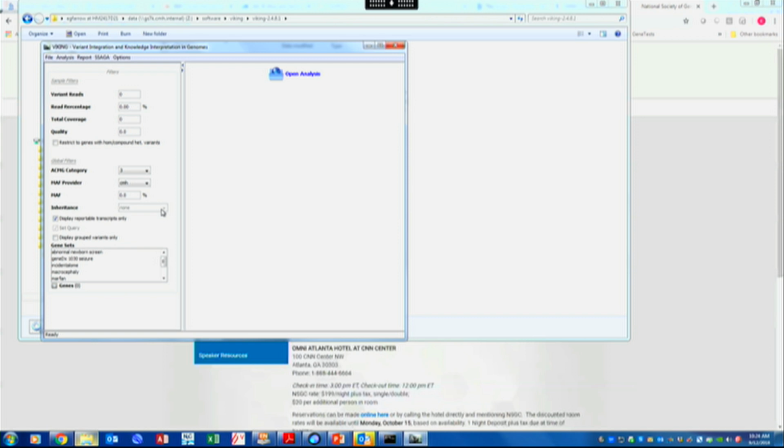Well, we come up with gene lists. We take off the gene list filters. We look for all of our checklists, and we report out variants that meet our reporting criteria, and a lot of them are going to be VUSs.